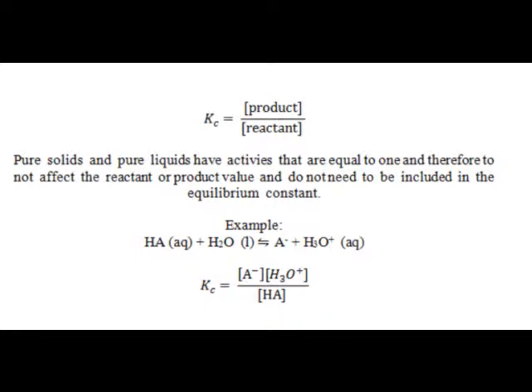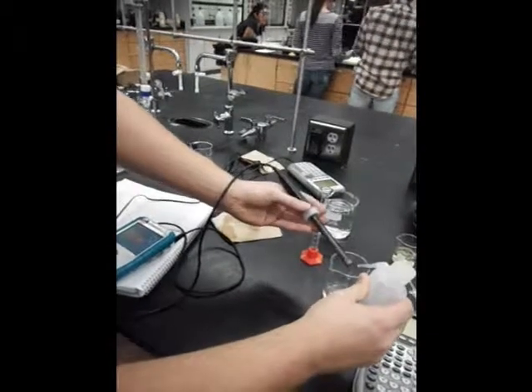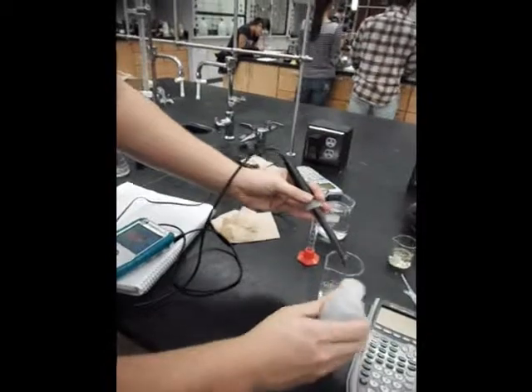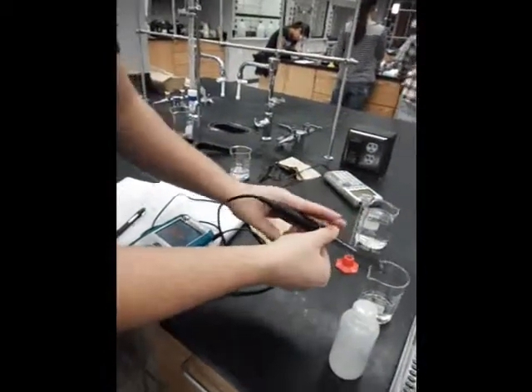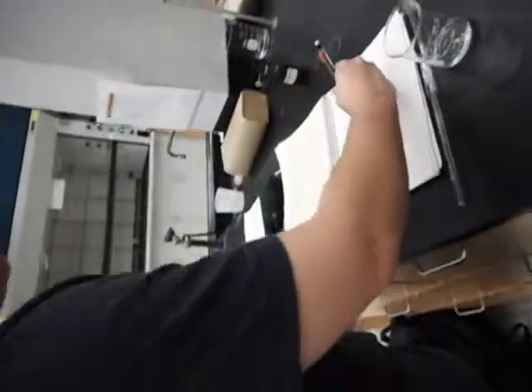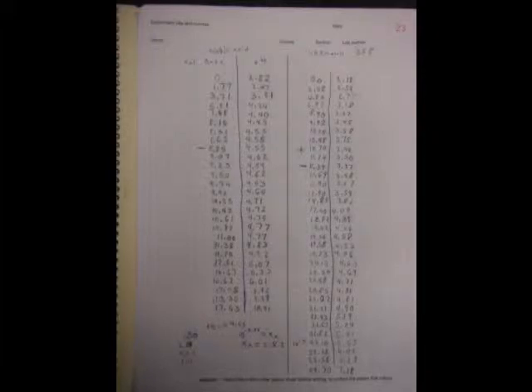Whenever you are finished and have gotten the pH of the solution, you want to wash off your pH meter with deionized water and then store it in deionized water. Then once that is done, you can clean everything up.